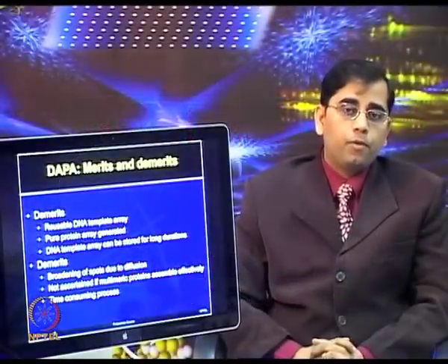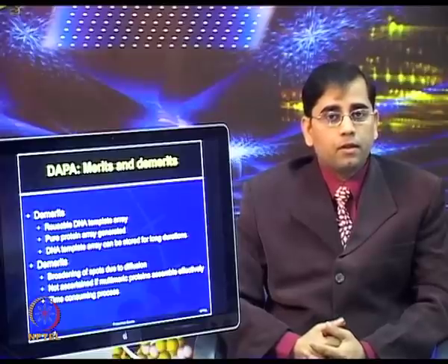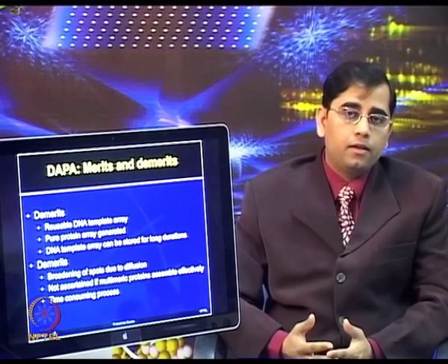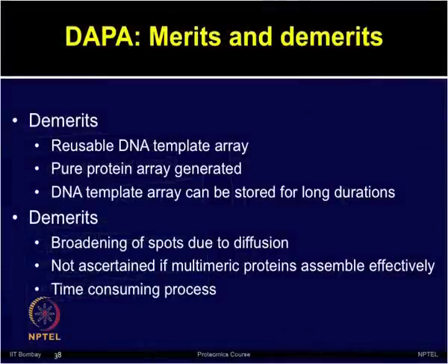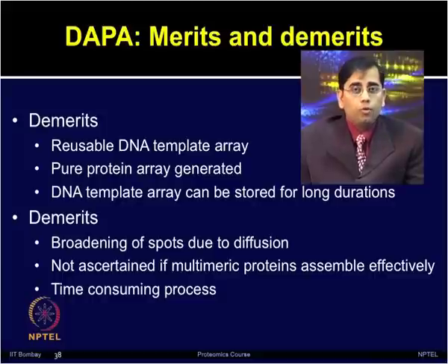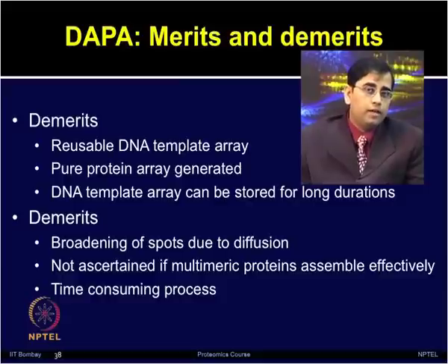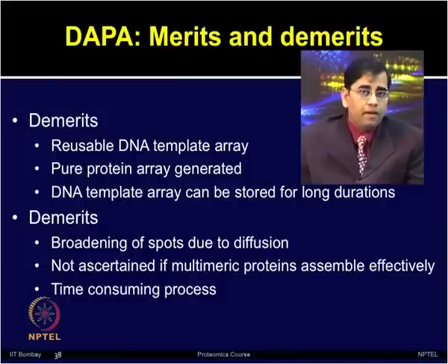The DAPA approach provides a few advantages as compared to the previously described methods. One can get pure protein because the protein is diffused from the membrane. There is a reusable DNA template, which is able to print multiple chips by using this chemistry. The source template, which is DNA, that array can be stored at room temperature for a long duration, and when there is a need for making protein arrays, one can use the membrane with the lysate, followed by generation of multiple protein arrays.